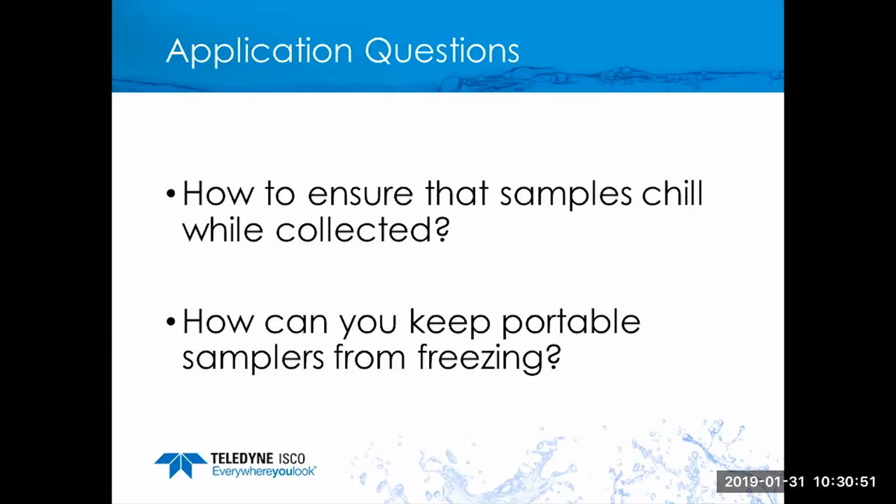There are fiberglass enclosures that are very finely and custom made out there from a variety of manufacturers. So an enclosure, in its most basic form, is just a box that houses the sampler. It need not be any fancy enclosure, but they are available, and it doesn't take long to look around.